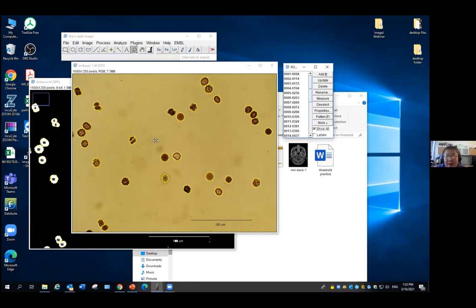So here I may have cut 1 cell into 2. I will just take it. Okay, I think it's good enough among the 30 cells. It actually should probably be 29 by human check. Getting this gives me 30. I will take it. If you don't like it, you can optimize your protocol.